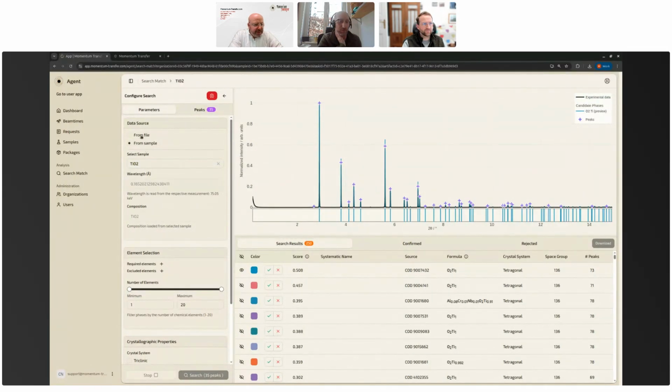Can it be used for XRD data collected from powder samples, like in the 2 theta range of 20 to 100 degrees, like powder XRD of BaTiO3, barium titanate? Yeah, absolutely. The angle range is agnostic, right? You can do whatever you measured between 0 and 180. But you have to set the wavelength to the right source that you used. But there's no requirement that it has to be over a specific angular range.